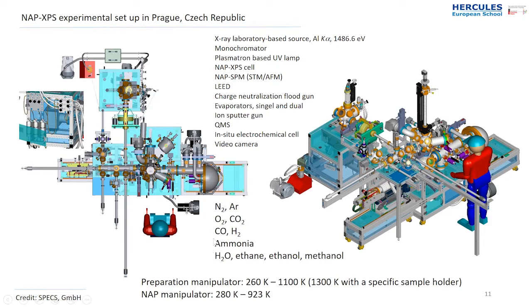We are also experimenting with ammonia, even though this is not the ideal gas used in ultra-high vacuum chambers. It's corrosive, but in a small amount or in a mixture with other neutral gases, it can actually work. And we did some experiments with ammonia as well, successfully.